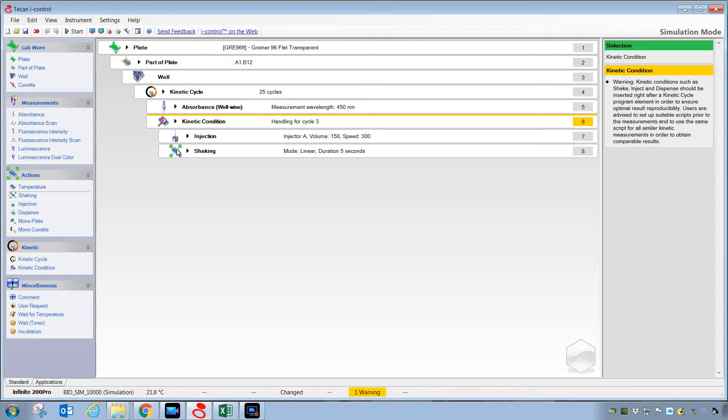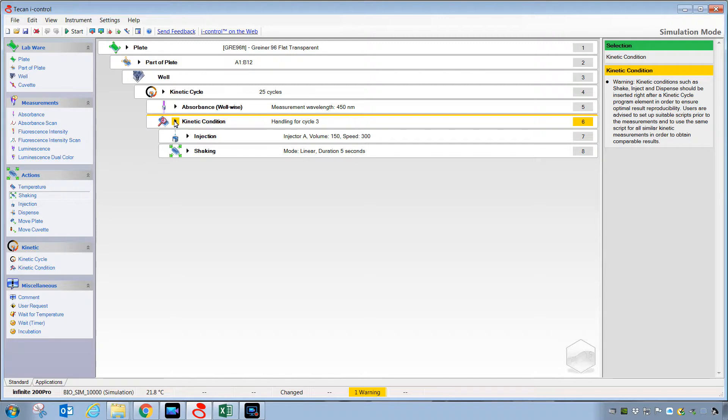This is a secondary nesting. We have 25 cycles reading absorbance. Only when we get to cycle number three will it perform these two steps.